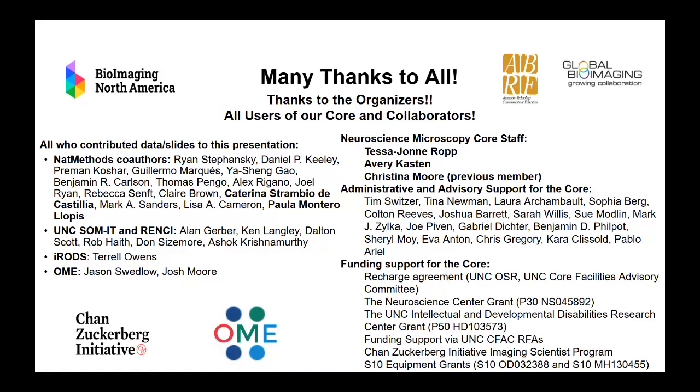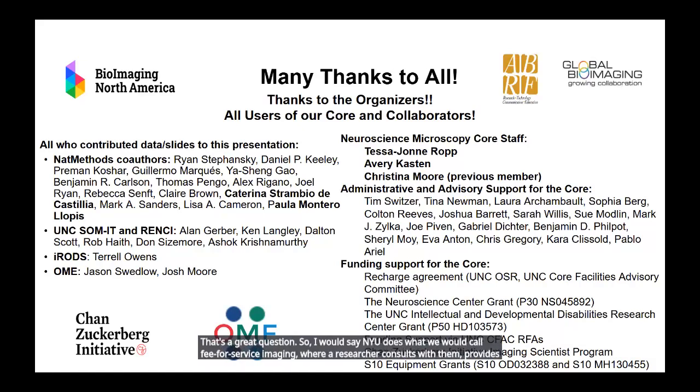That's a great question. So I would say NYU does what we would call fee for service imaging, where a researcher consults with them, provides them a sample, their staff do the imaging, and they provide the images to the researcher, right? We don't, right? So they have a slight pipeline for what that is, and they helped present that at the OME meeting.